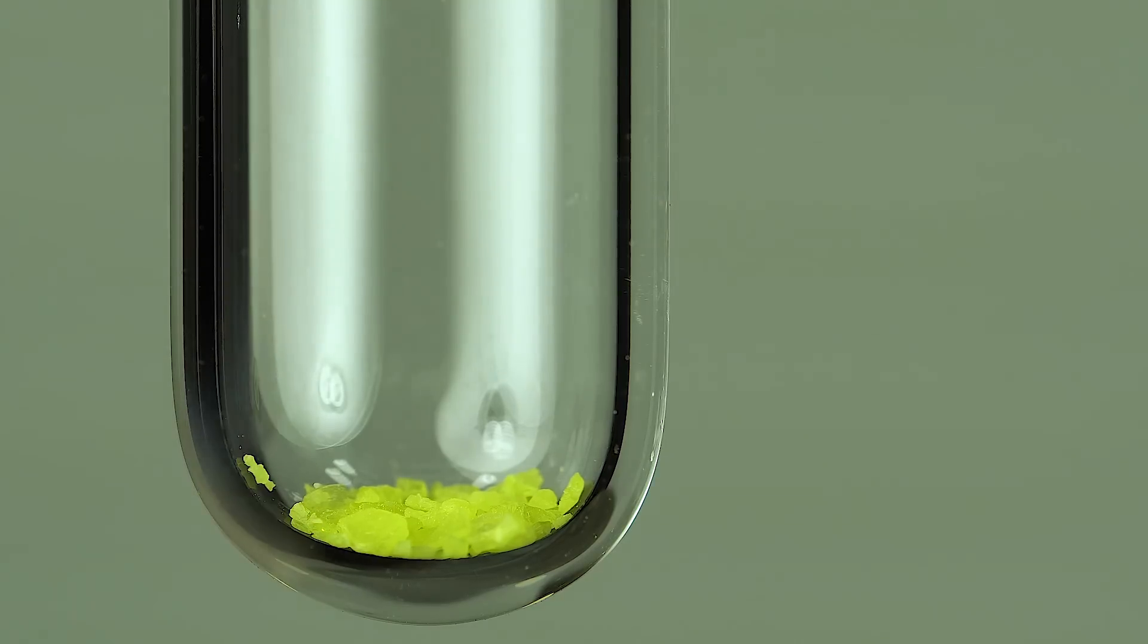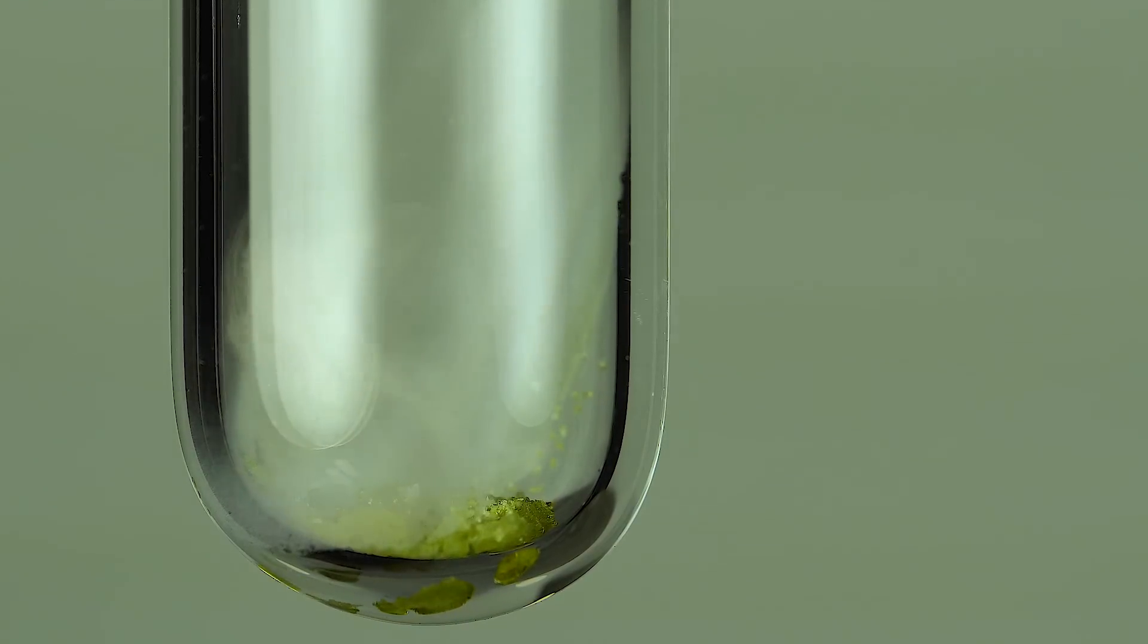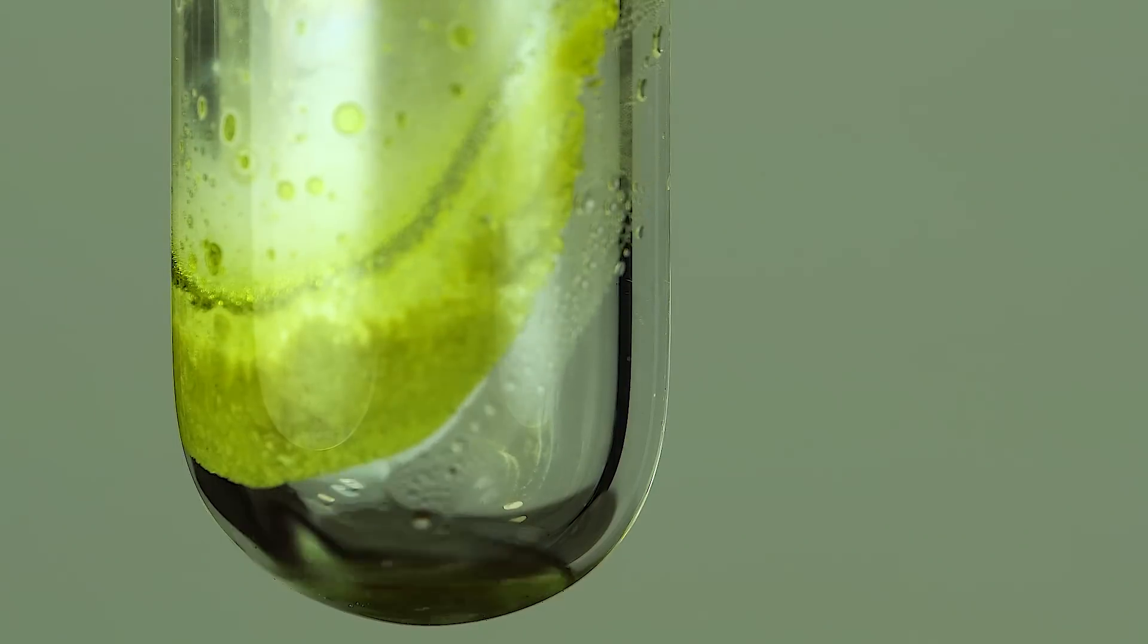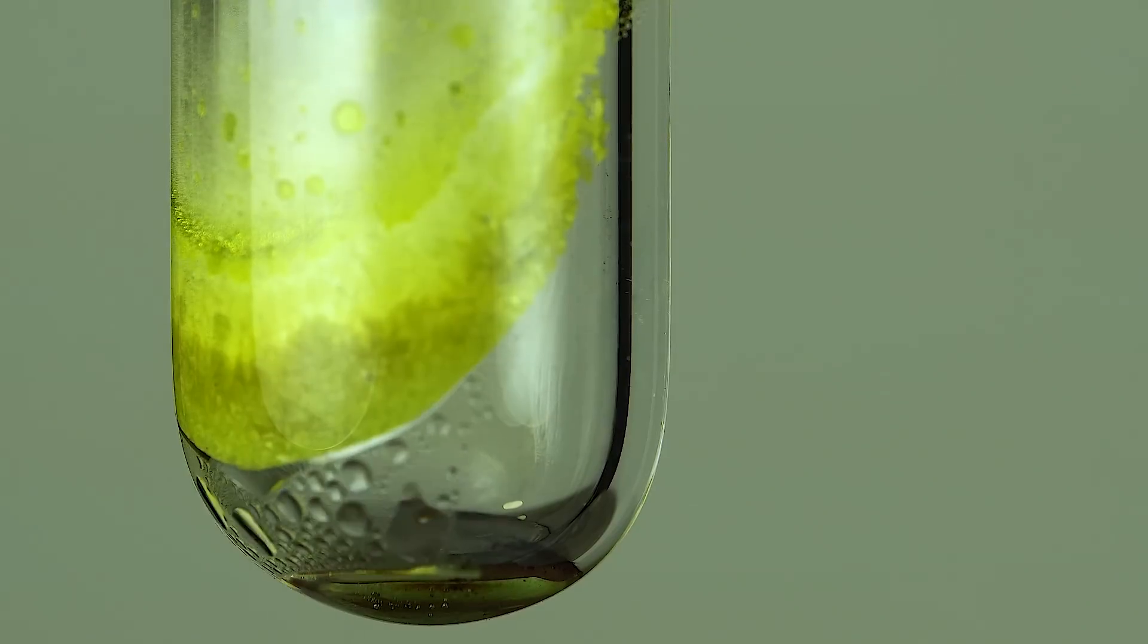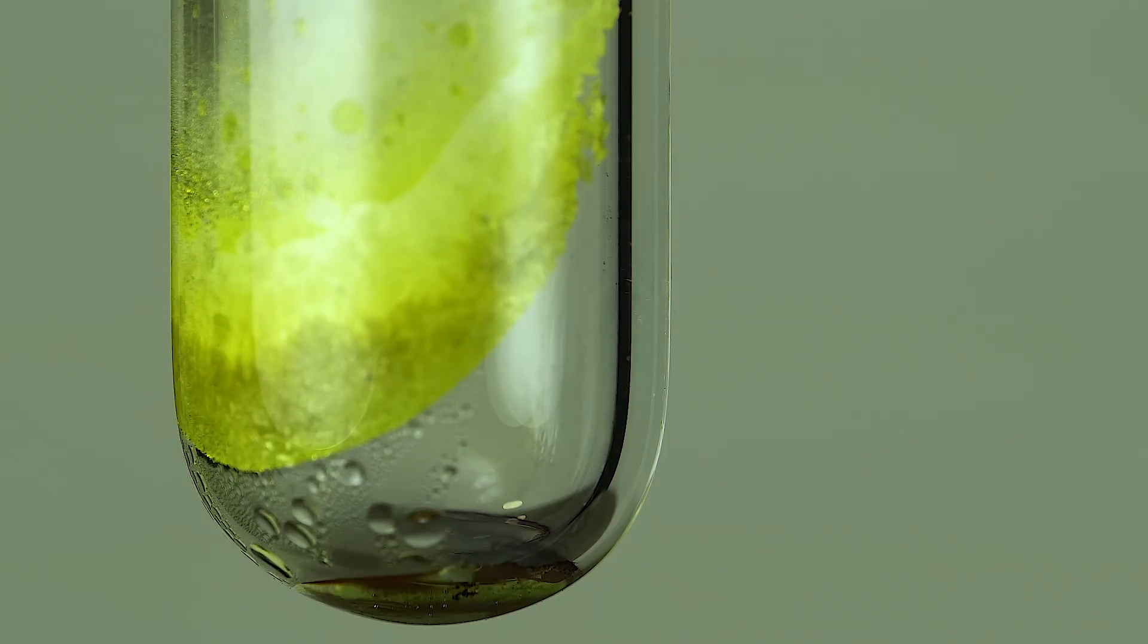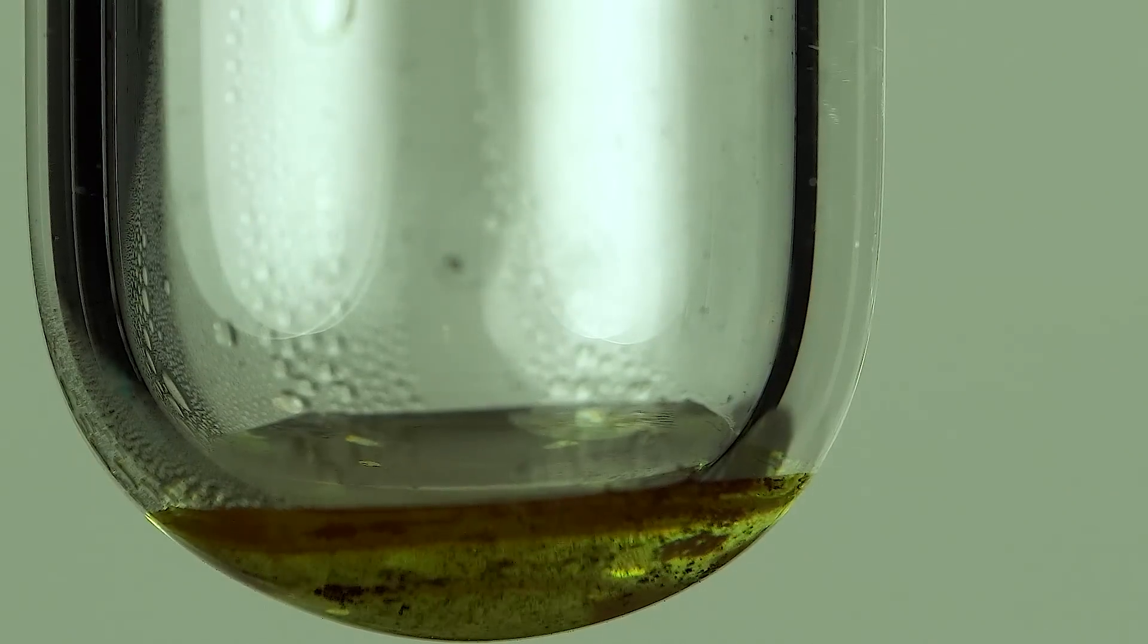Rhenium Heptoxide crystals have the properties that are typical of molecular ones: low stability of the crystal lattice and low melting and boiling points. When heated to 300 degrees Celsius, Rhenium Heptoxide sublimates and settles down on colder tube walls. Look how beautifully Rhenium Heptoxide is crystallizing.